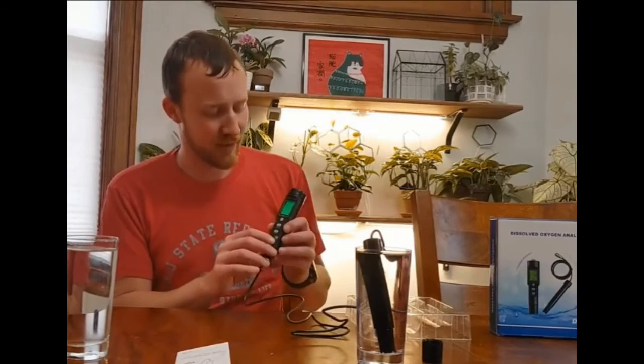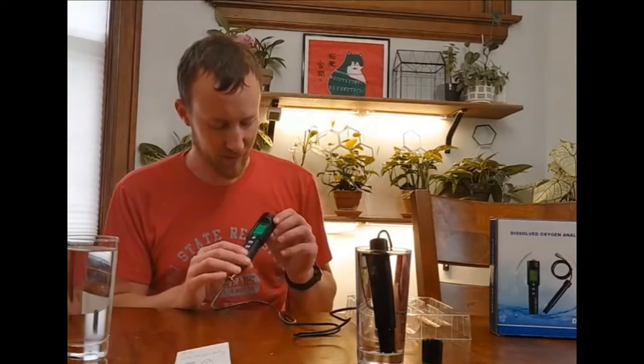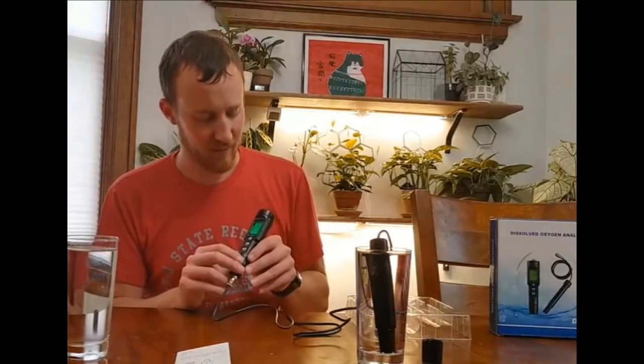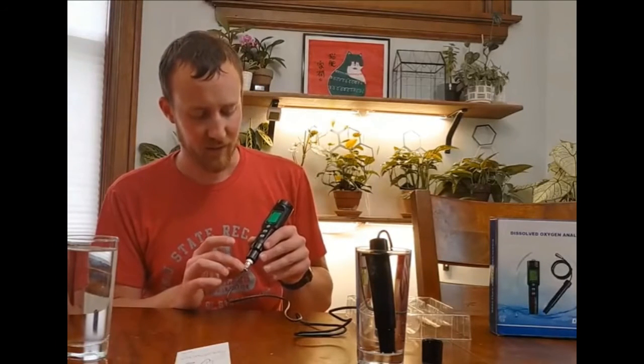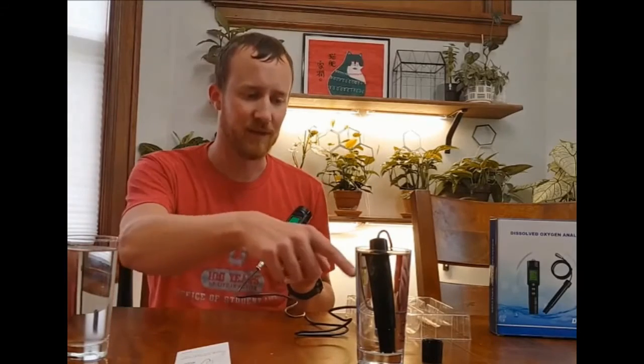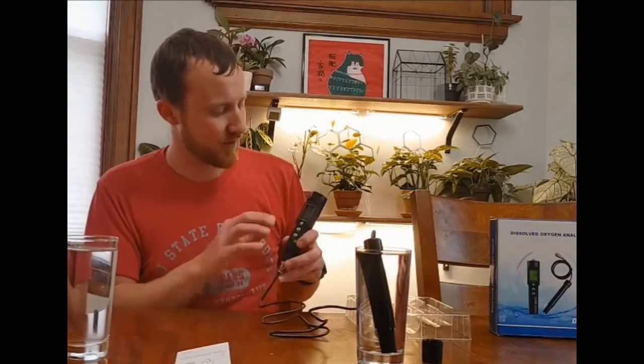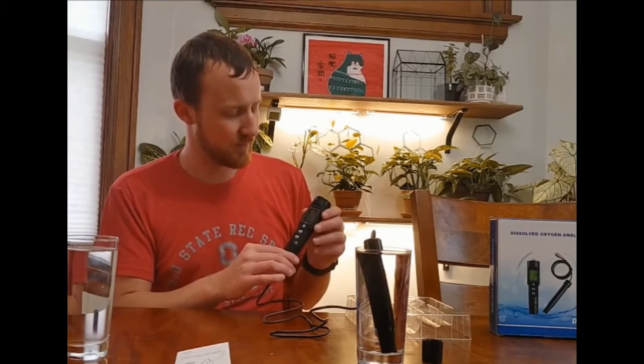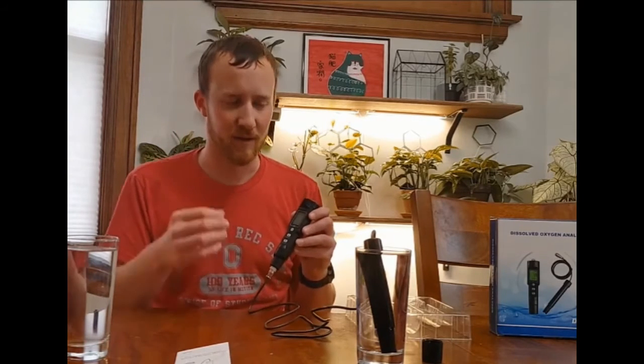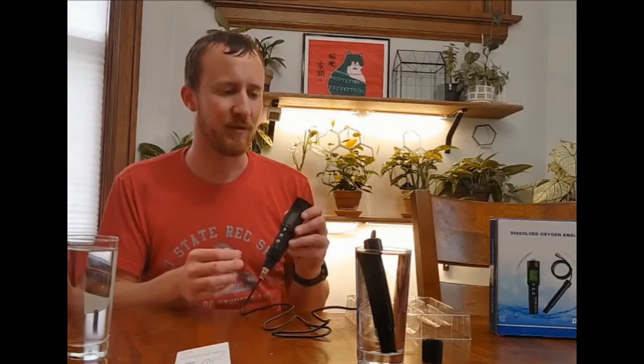I'm going to be trying this out for brewing and everything. Initially, this is looking like it is measuring at least directionally properly. This has less oxygen than this does. I haven't done a really detailed sample yet to make sure it's truly measuring accurately.